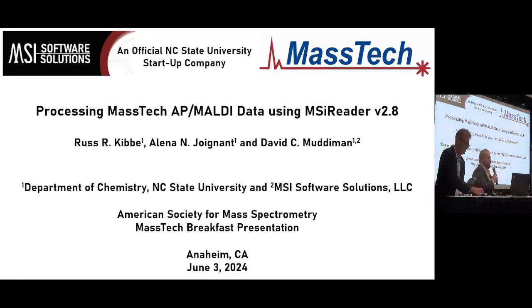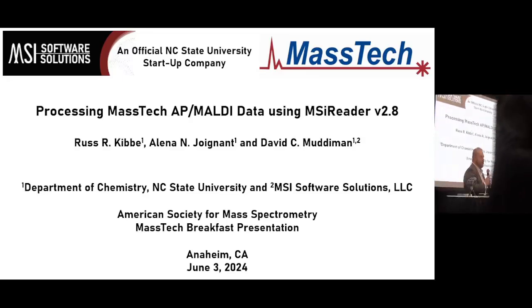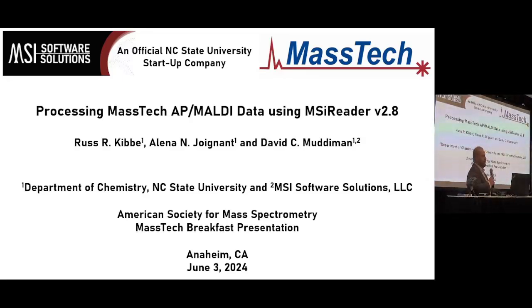All right, hi, good morning everyone. Like he said, I'm from NC State University. I work under David Muddiman, and this morning I'm excited to talk to y'all a little bit about MSiReader, some of the things that it can do, and then show some examples on some AP MALDI data using the MassTech AP MALDI source.